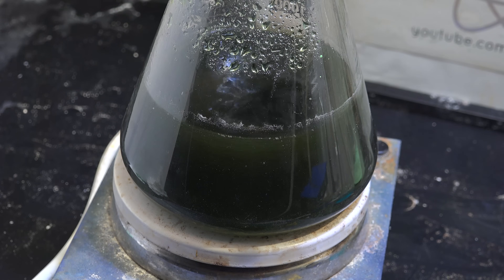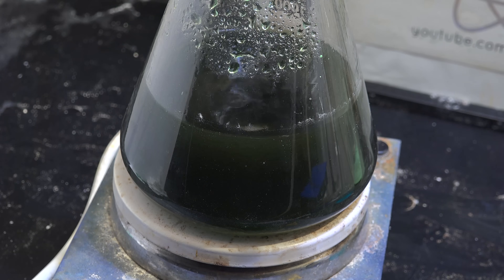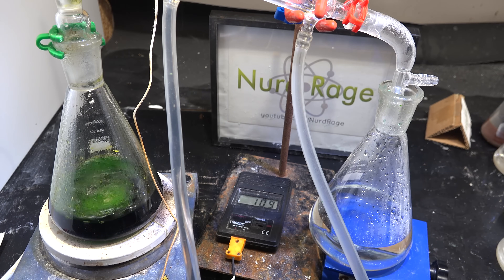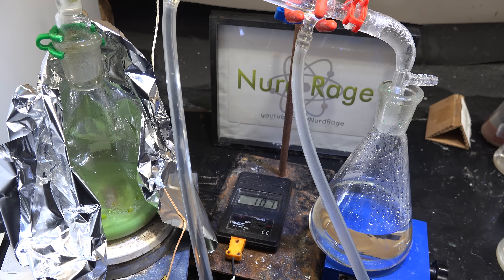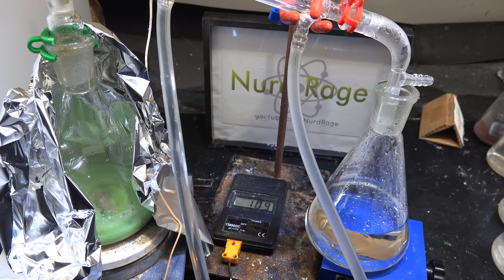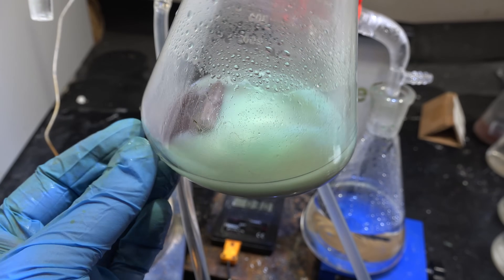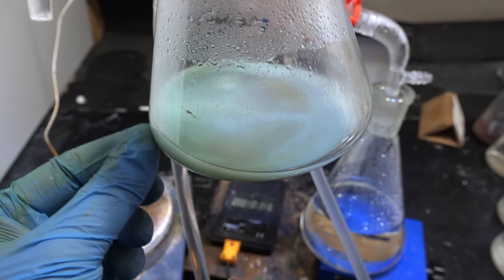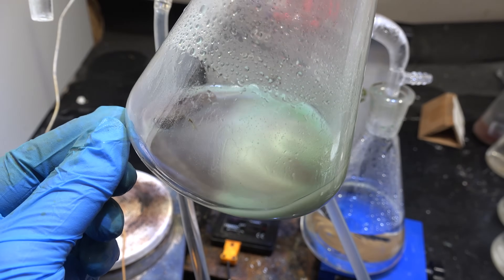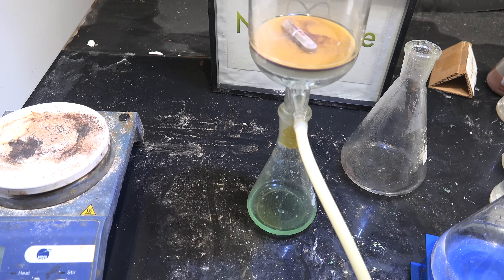Now we have a solution of sulfuric acid, hydrochloric acid, and small amounts of copper salts. To separate our sulfuric acid, distill off the remaining hydrochloric acid and boil down with the maximum hot plate temperature until nothing distills over. With the hydrochloric acid completely removed, the sulfuric acid solution will precipitate out copper sulfate and copper chloride salts, as they have very low solubility in high concentrations of sulfuric acid. Now filter our sulfuric acid to remove the nearly insoluble copper chloride and copper sulfate salts.